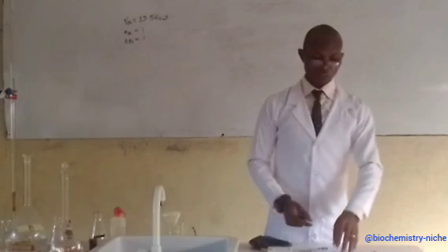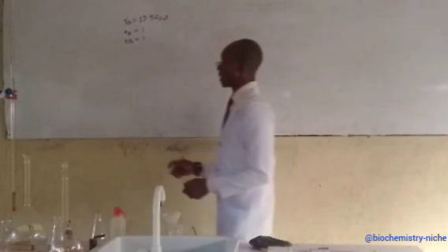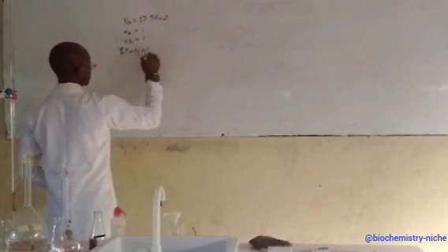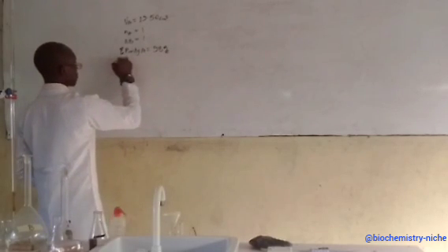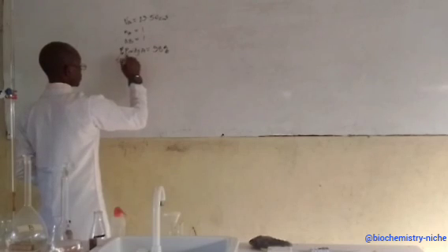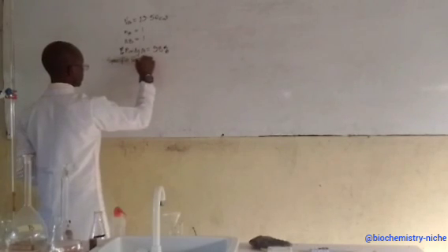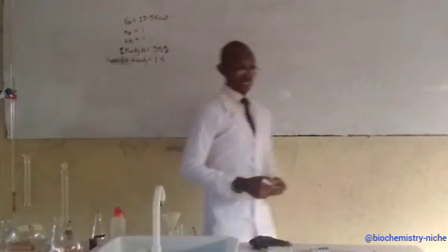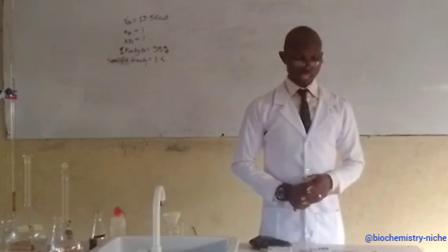So let me just list out a few parameters. Let's assume for the A, you are given the percentage purity. Percentage purity for A is 98%, then specific gravity is 1.8. Yes, that is the gravity for the acid, which is the H2SO4.